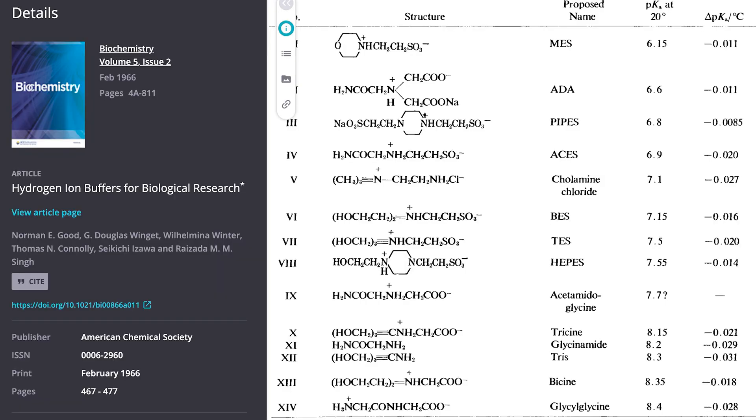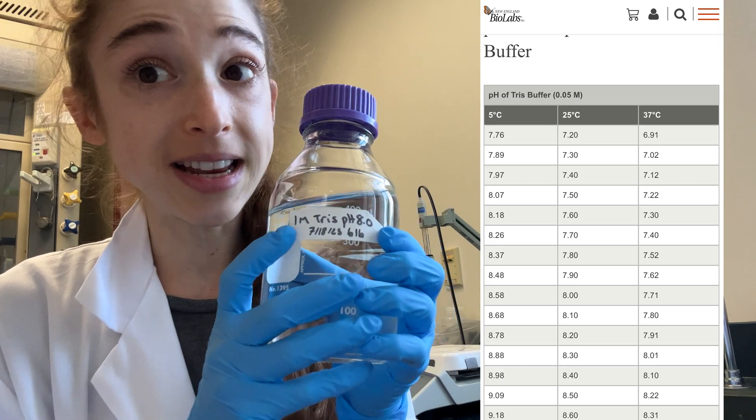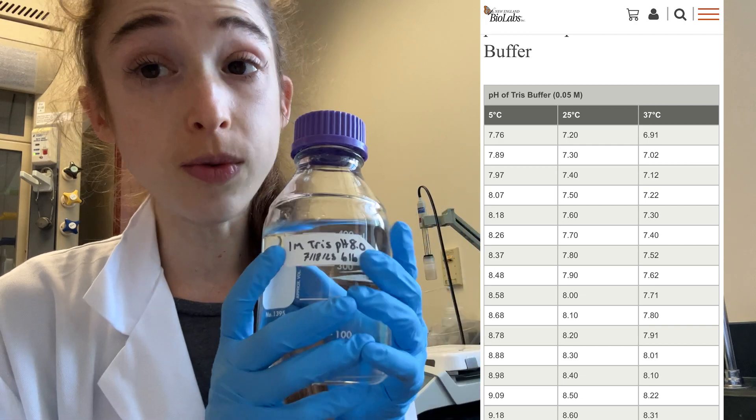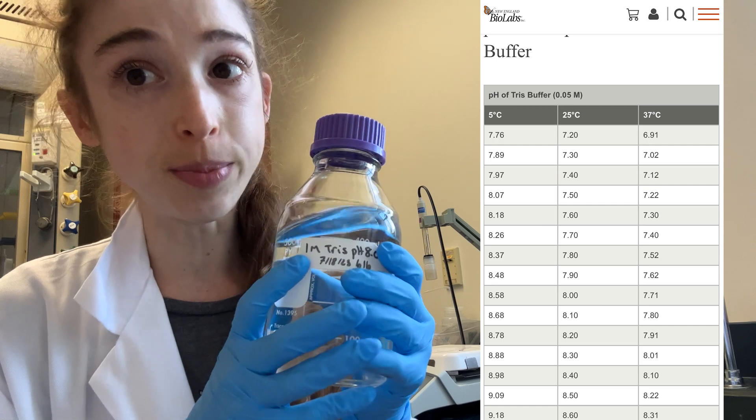Some buffers are more notorious for this. The most notorious is Tris. Basically, for every decrease in a degree Celsius that you go with your Tris buffer, you're going to get an increase of about 0.03 in your pH.